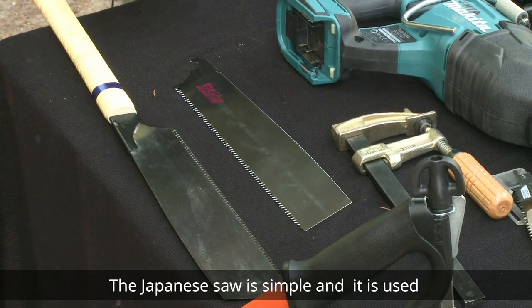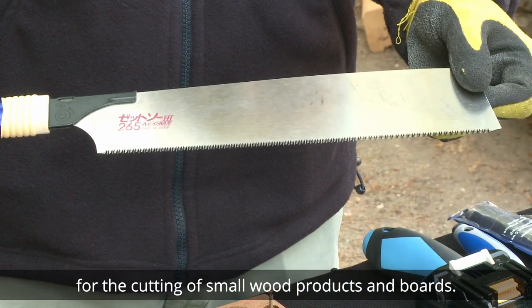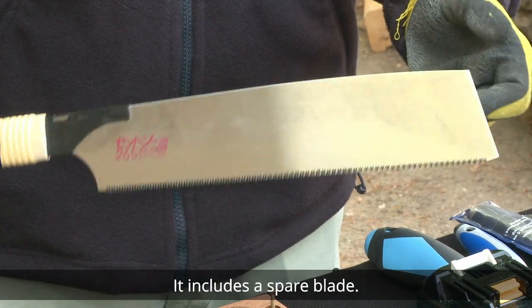The Japanese saw is simple and it is used for the cutting of small wood products and boards. It includes a spare blade.